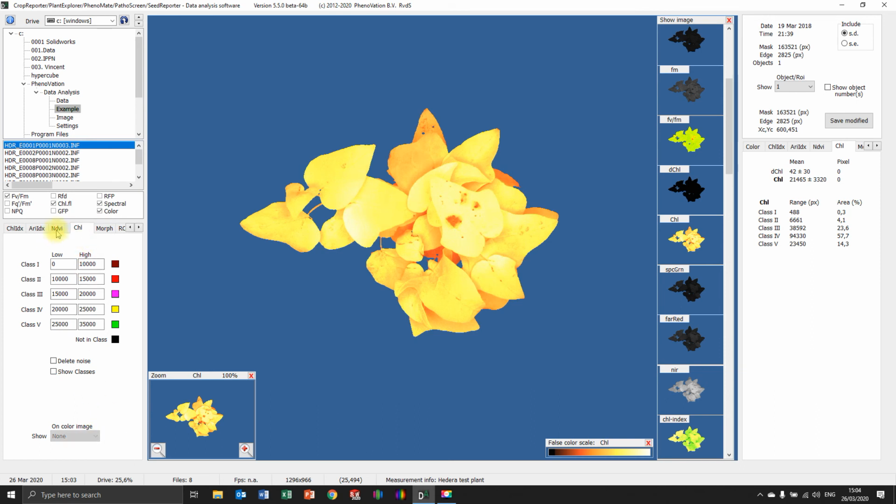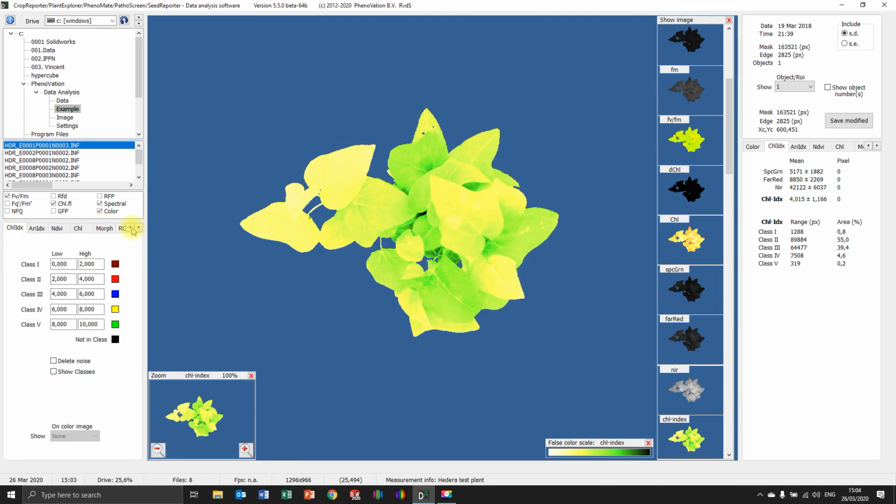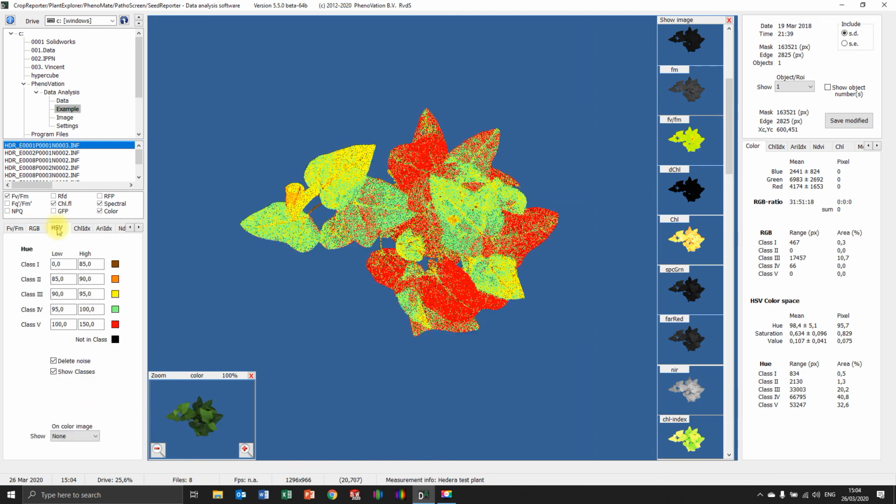So this is pretty much all the classes you can set. These classes we can also log. We will go over that in another tutorial. So hopefully you understand this. Just play around with it. Get a feeling how it exactly works and see the power of the tool. Because especially those classes, if you have a good benchmark and you set proper ranges, you can get way more out of your experiment because you have just way more information about it.